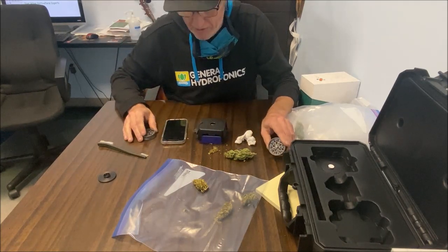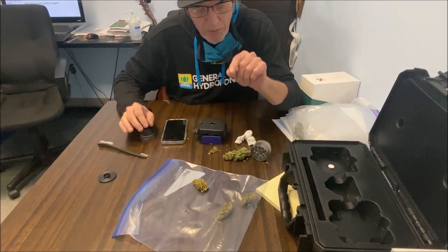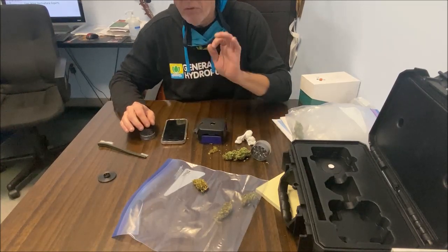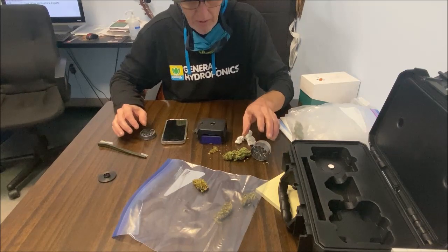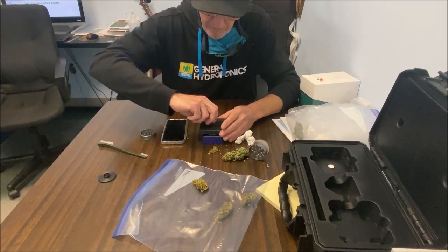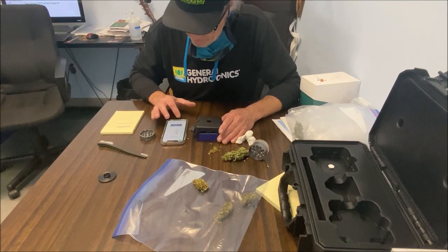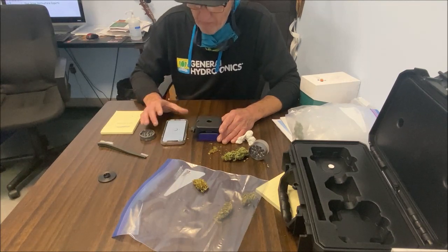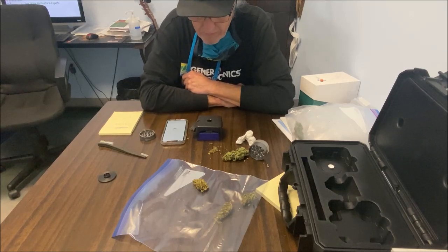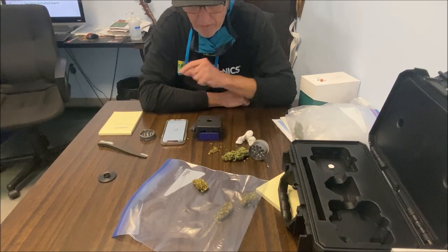Okay, wow, this has really got a nice smell to it. So this is where the terpenes come from. Terpenes are the things that make it taste and smell. So that terpene profile also governs how you feel it. So let's tamp that down. Okay, here we go. And it's scanning. And there's the light.